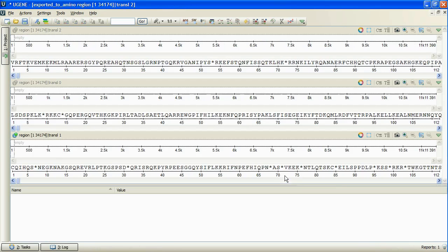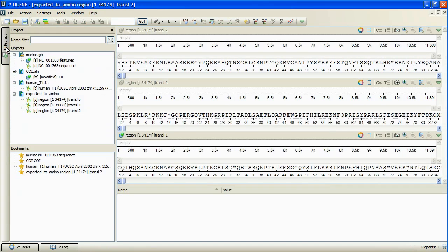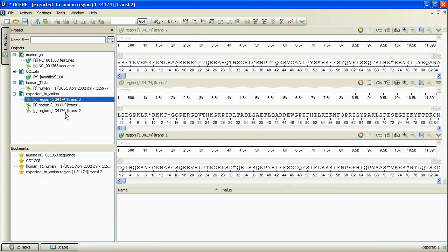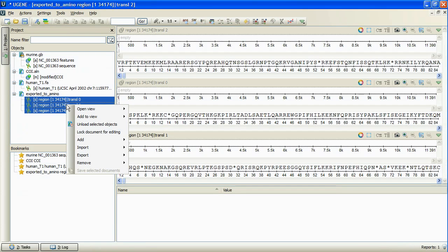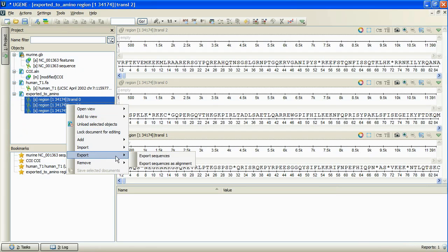Here is our translated amino acid sequence. It is possible to perform the bulk translation now. We select the corresponding sequence items in the current project view, bring up the context menu and select export, export sequences.